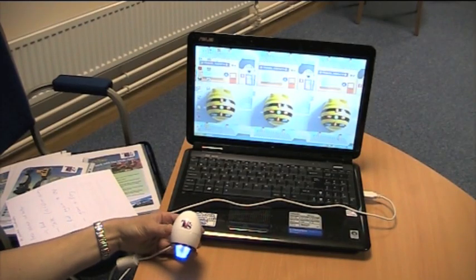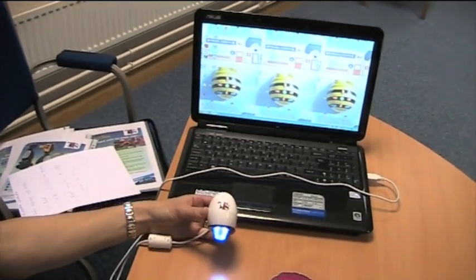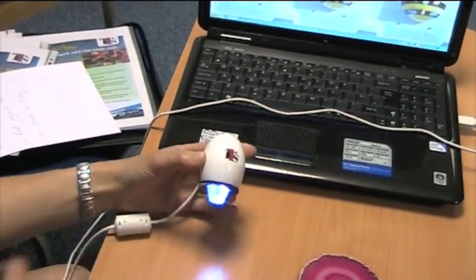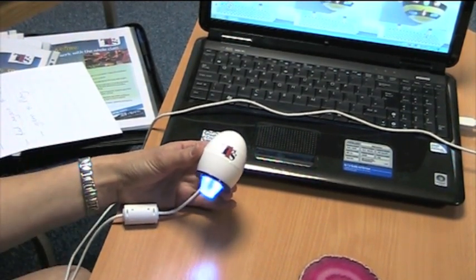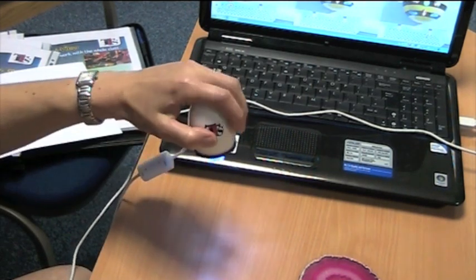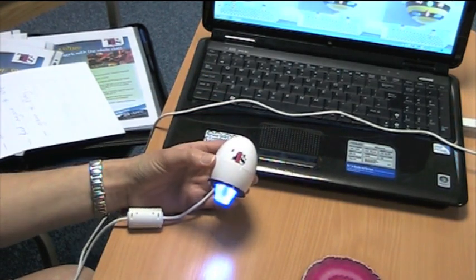This is TTS Easy Scope. It connects via USB on your computer or laptop. We've got removable plastic ends so they can be easily washed. Great for using anywhere where you're looking for a microscope to be used. It can be used with soil samples, leaves, etc. It's a nice size for children to be able to hold and the main thing is it's very, very simple to use.